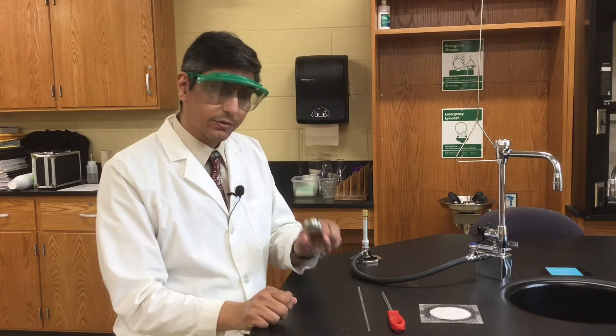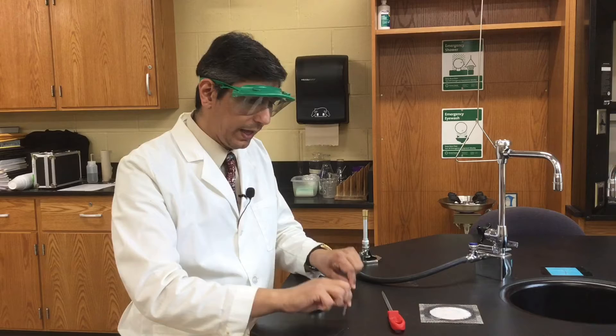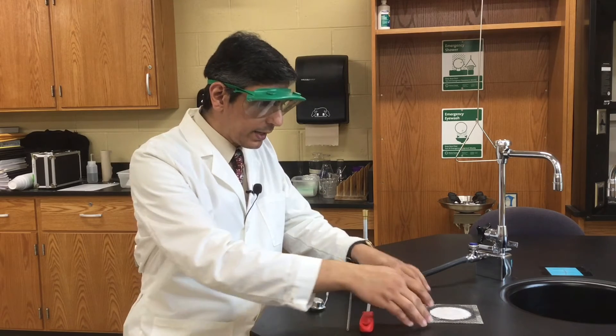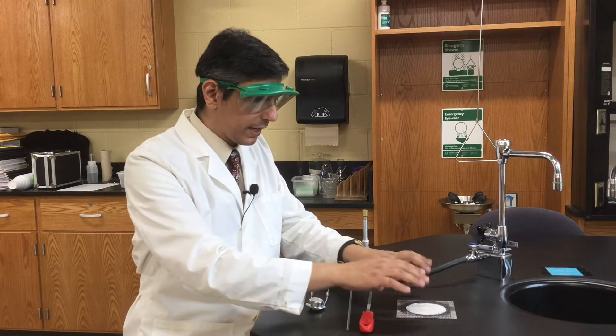Now in order to do this you're going to need a Bunsen burner as well as a striker, a piece of glass, a steel file, and a wire gauze to protect the lab surface.